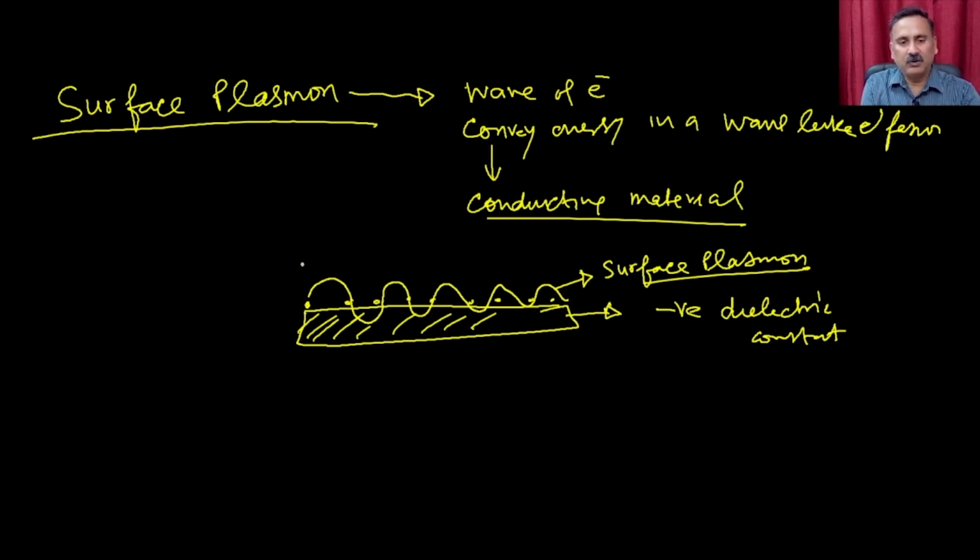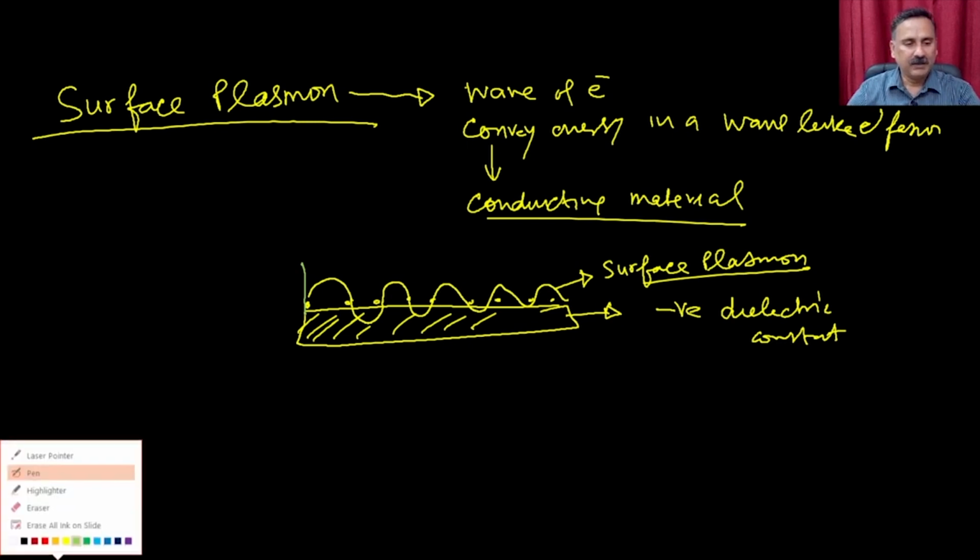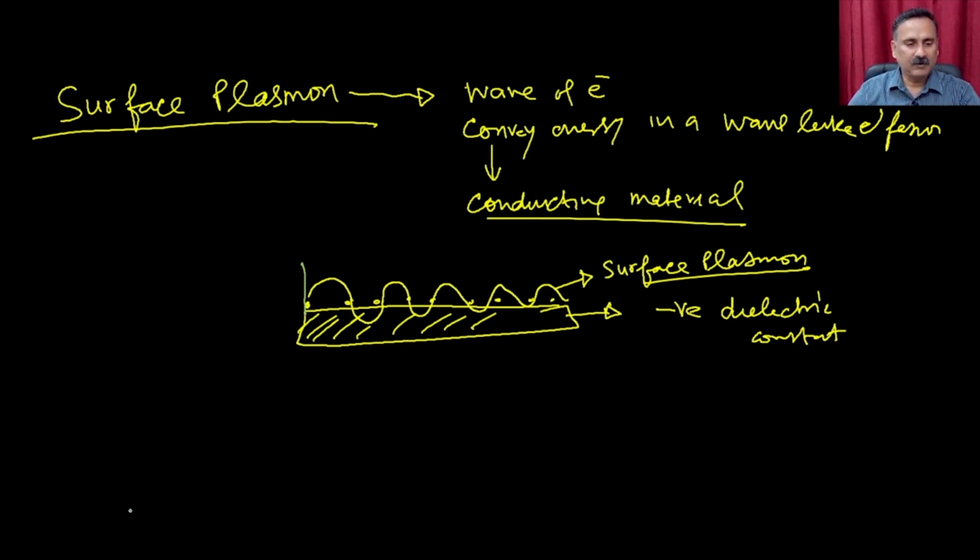How it is going to form is that you are going to have the water molecule. If you keep the water molecule in front of this particular metal surface, what will happen is that the gold, the water or buffer, for example, right?